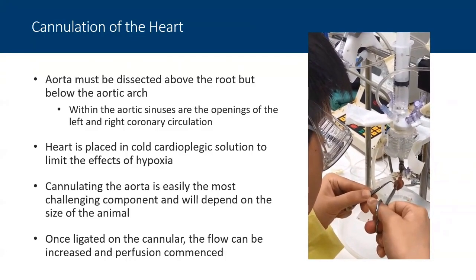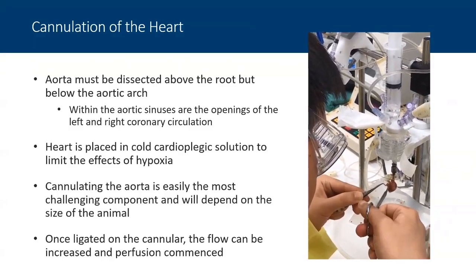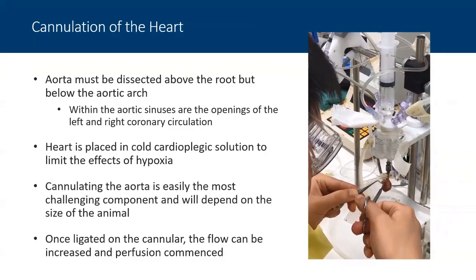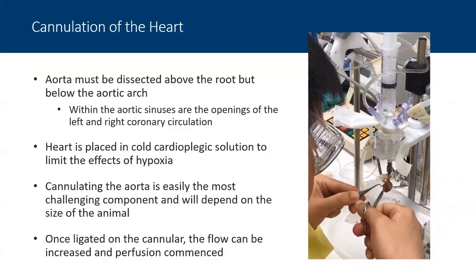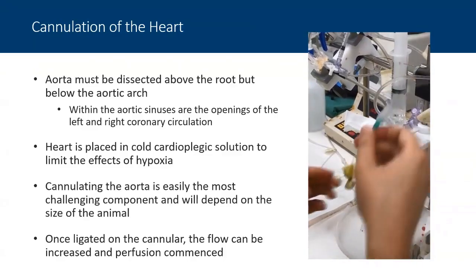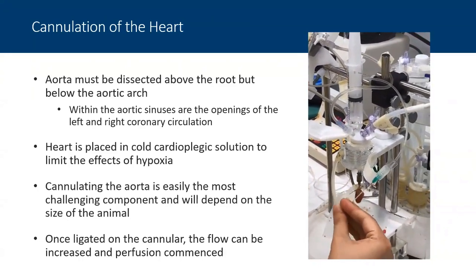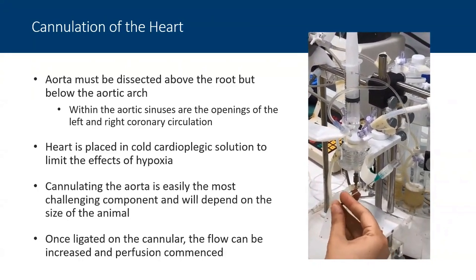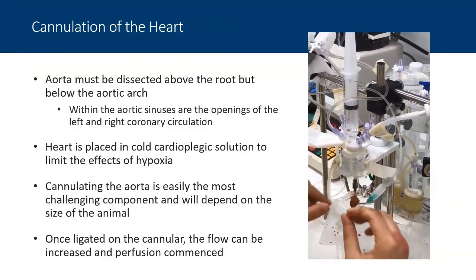It would drag the heart down the aorta, creating additional pressure. And what we'll eventually see is we'll just twist the heart, and we'll start getting ready to insert the balloon into the left ventricle. And this will allow us to monitor the pressure that is developed, both the systolic pressure and also the diastolic pressure.